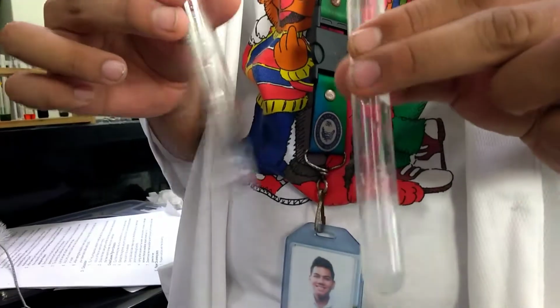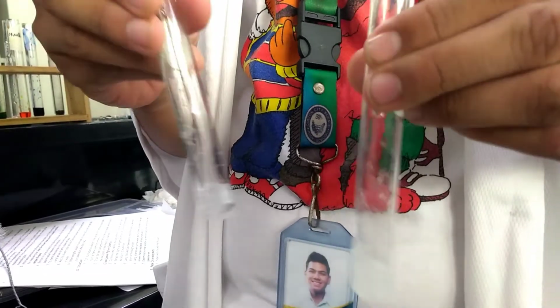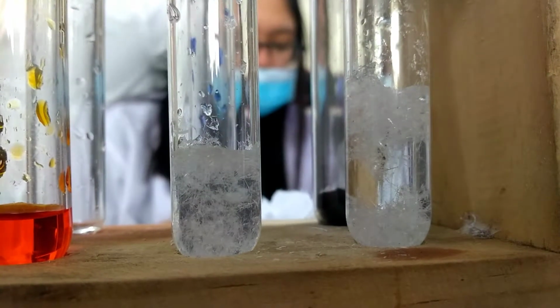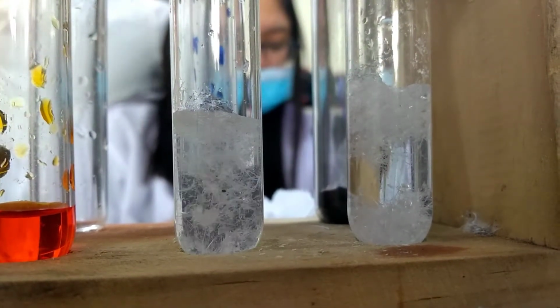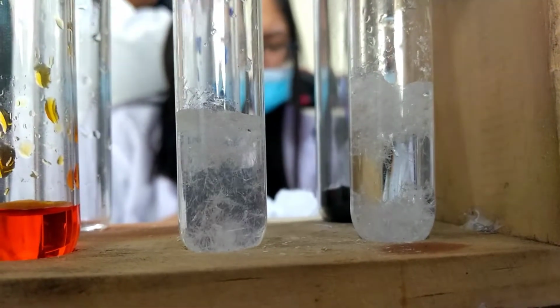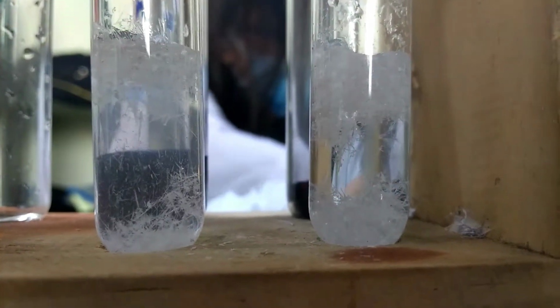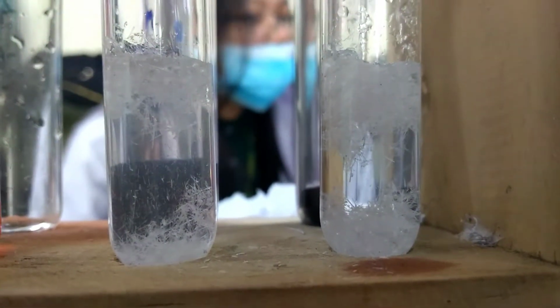Step 6. To identify the sublimate in the funnel and the residue in the evaporating dish, transfer a small amount of both in separate test tubes. Step 7. Add 2 milliliters of water in both test tubes. Step 8. After noting the solubility in water, add 3 to 5 drops of BaCl2 to both test tubes. Step 9. Take note of each step and record your observations.